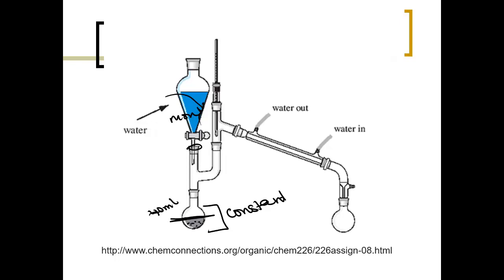This must always be constant. This right here should be sealed off with a stopper, so the separatory funnel goes in the stopper, and you can put a stopper on here just to help keep it closed but not tightly closed, or you don't have to put a stopper. It's not terribly important, but this should be closed off, otherwise the steam is going to just come out.